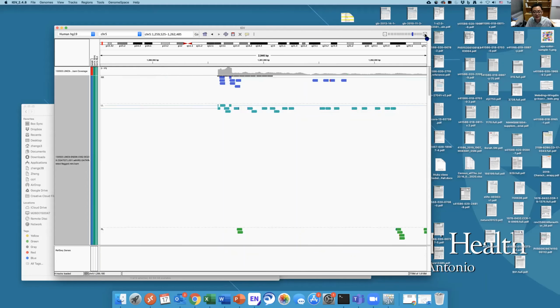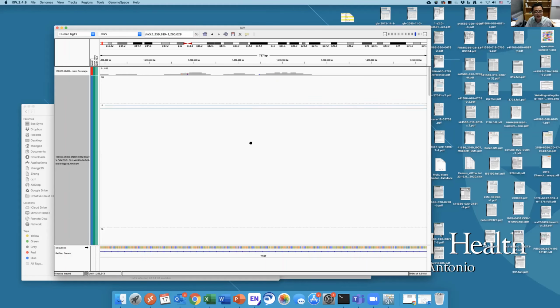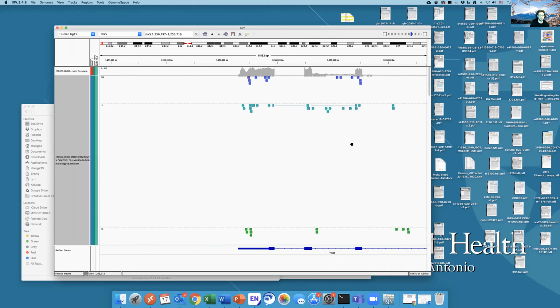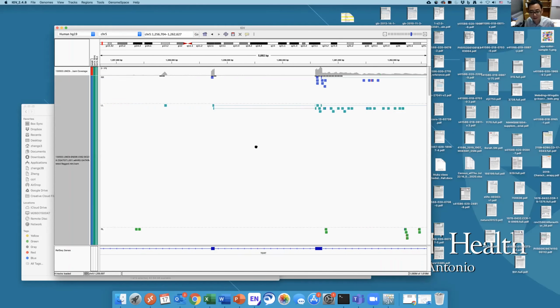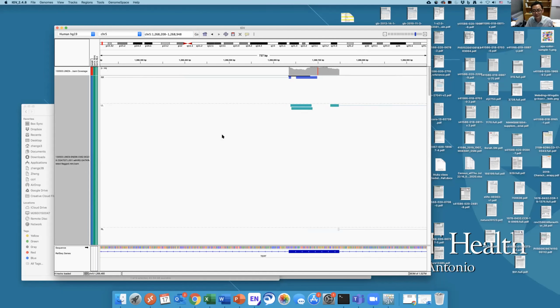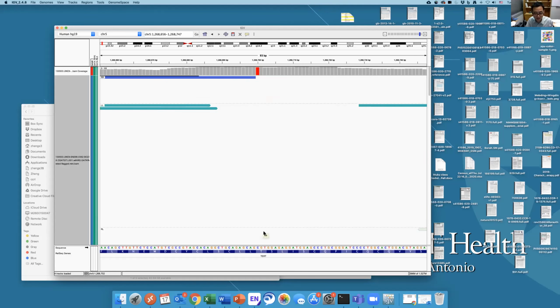And if you zoom in, let me zoom in. So you actually can also see the mutations. Okay, let me see if there's any mutation. Well, in this case, it doesn't seem that there is any mutation. Oh, right here. Okay, and if you zoom in, well, this is probably not a good example. So see, these are indicating there is a mutation here.